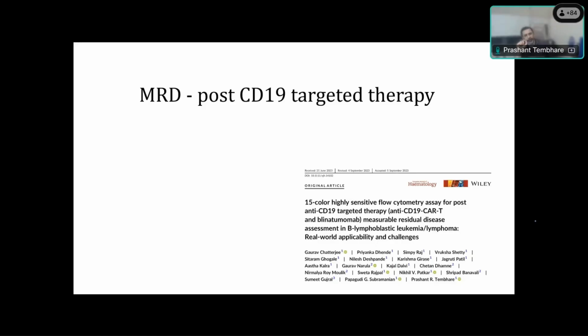In CD10 also you have to look, because CD73 is weakly expressed in stage 2 hematogones, and in stage 2 hematogones we know CD10 expression is weak. But if you have CD10 brightly expressed cells and CD73 is positive, that is also aberrant. So the fruitful combination is to look at CD73 against CD10, and CD73 against CD34.